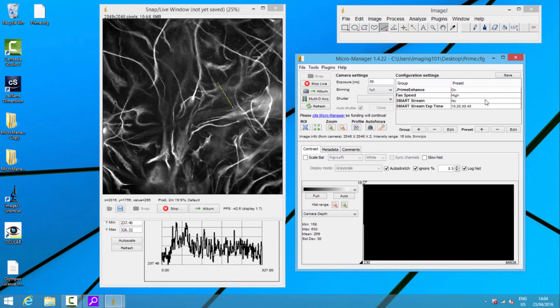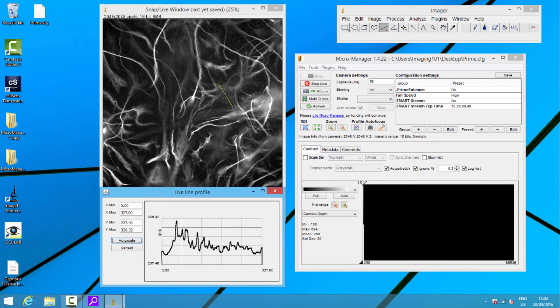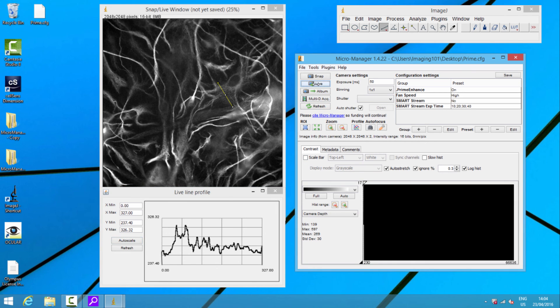If you need to and it makes sense to, you turn on Prime Enhance. And now you can work with shorter exposure times, having less light hitting the sample in a time-lapse experiment or any type of experiment like that, and get a better quality image. You can use it in other systems. Like spinning disk is really good because at that level, you're going to have a lot less light getting to the sample anyway. Your camera is going to be more sensitive. This will work really well for those types of jobs. Put less light on your samples. Let your samples live for longer. It's Prime Enhance inside Micromanager.